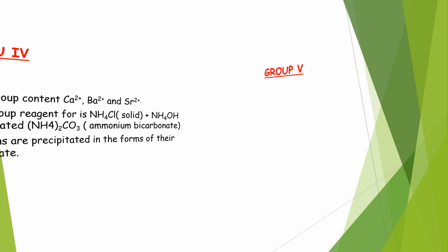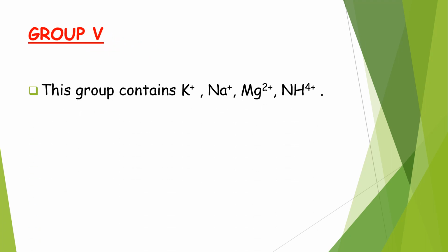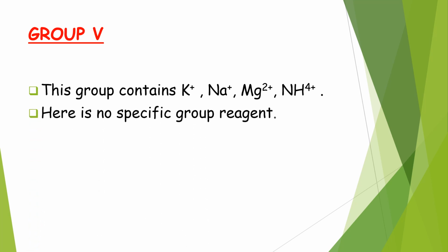Now moving to group 5. This group contains sodium, potassium, magnesium and the ammonium ion, and there is no specific group reagent. This group also contains the lithium ion, but we did not discuss it here, and we could discuss it in another separate video.